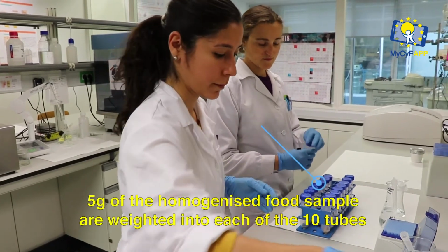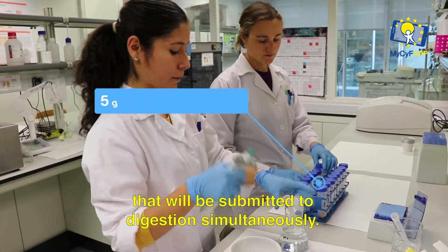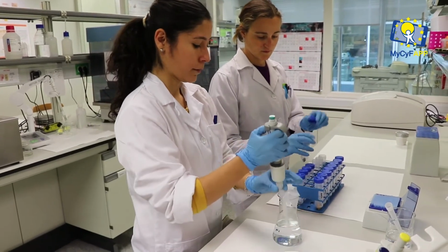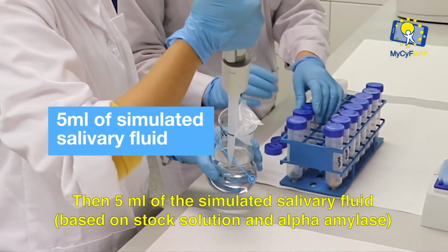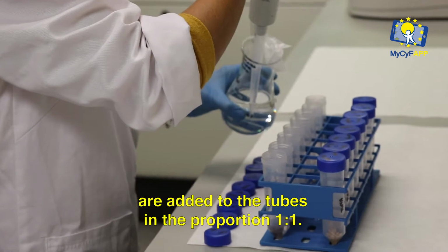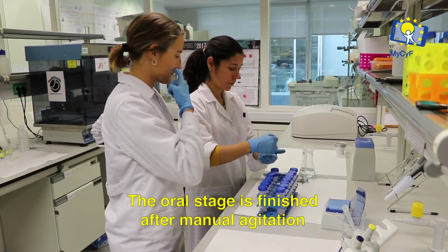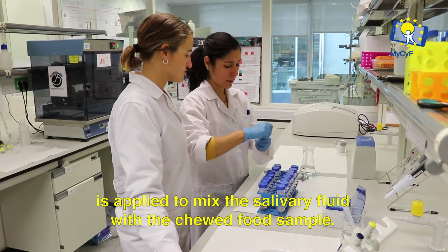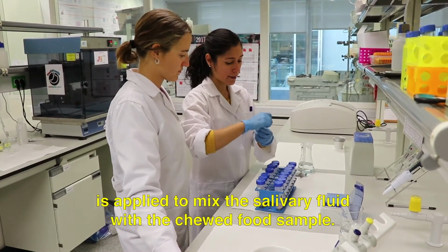5 grams of the homogenized food sample are weighed into each of the 10 tubes that will be submitted to digestion simultaneously. Then 5 milliliters of the simulated salivary fluid, based on stock solution and alpha amylase, are added to the tubes in the proportion 1:1. The oral stage is finished after manual agitation is applied to mix the salivary fluid with the chewed food sample.